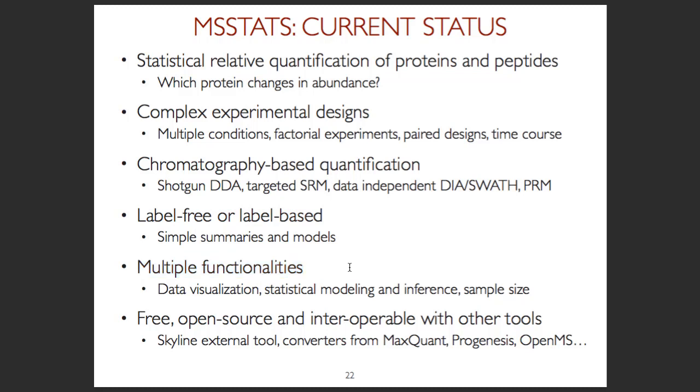So even though tools such as Skyline, OpenMS, and others include a lot of data visualization tools, we have some of them as well, emphasizing things which are important for statistical analysis. And of course, statistical modeling and inference, and sample size calculation is a really big part of what people need to know.